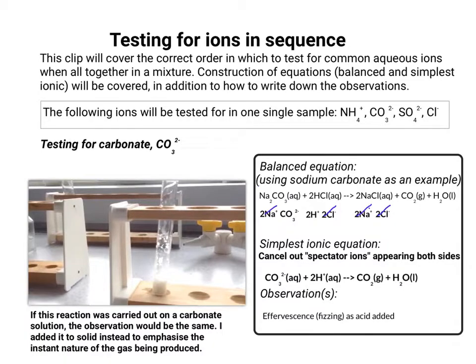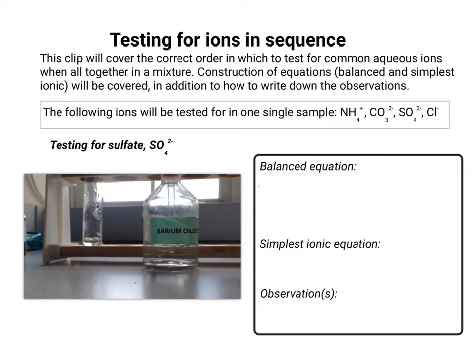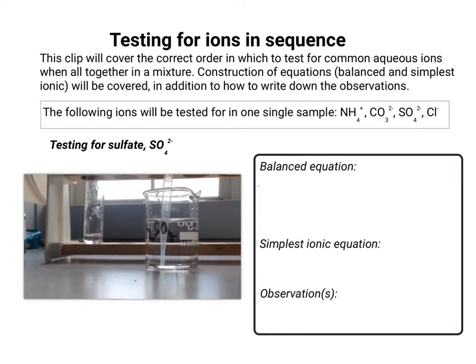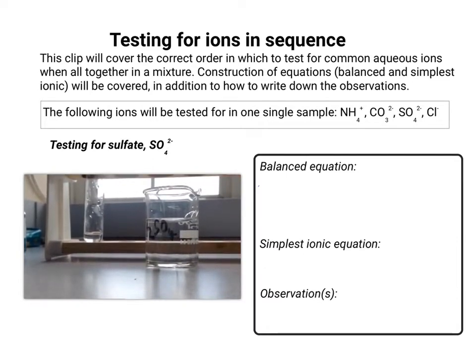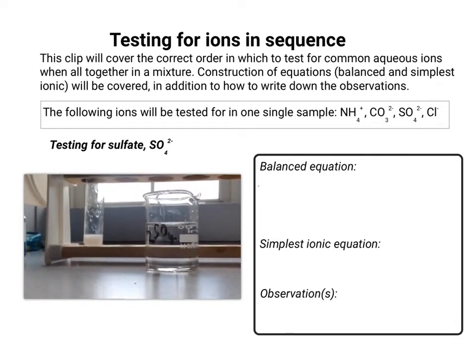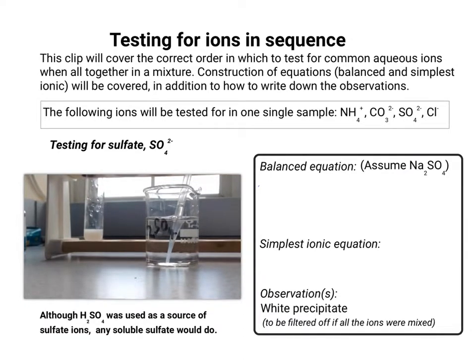The next thing to look at is the sulfate ion — taking care because barium chloride is toxic. We take some sulfuric acid and add it to the barium chloride. You can clearly see a white precipitate of barium sulfate forming. The observation here would be a white precipitate forming. If all your ions are mixed together, you'd now have to filter this off, because the next test — the chloride test — also produces a white precipitate.